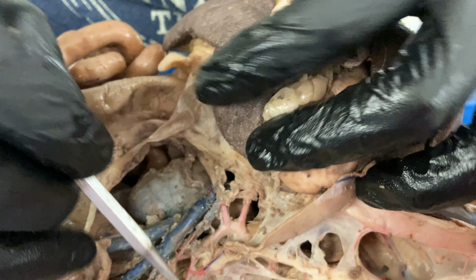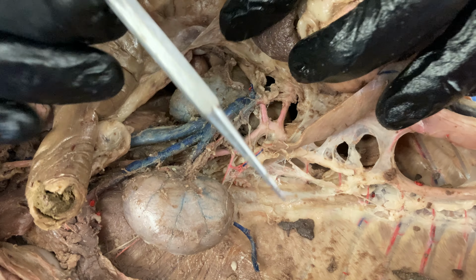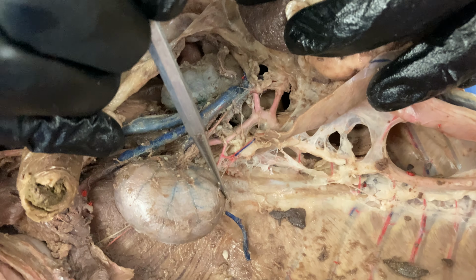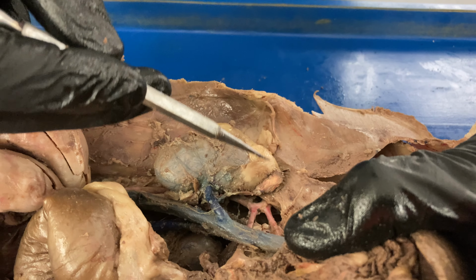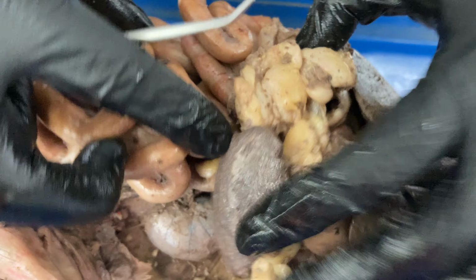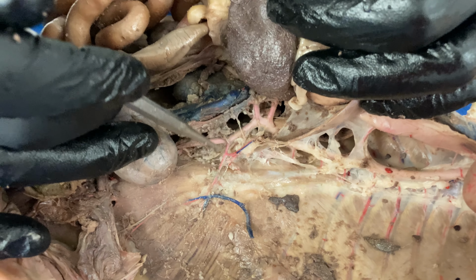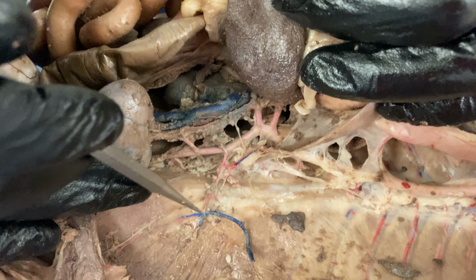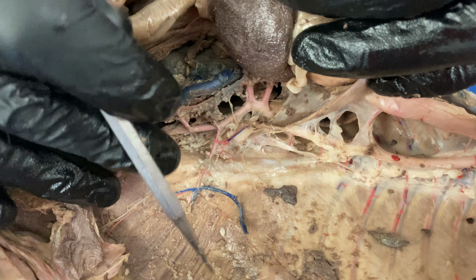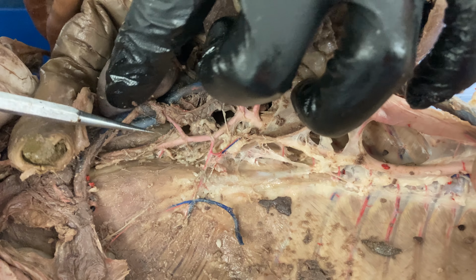The next branch that we want to be looking for is the adrenolumbar branch. So here's our kidney. So usually our adrenal gland would be sitting up here. You can actually see it. I'm going to flip back over here. On this kidney, I haven't removed the adrenal gland, so it's still there. So this is what it would look like. But you can see the adrenolumbar branch a little bit easier here coming off of the aorta, because it's going to have a branch coming to the adrenal gland and a branch coming back to the lumbar region of the back.